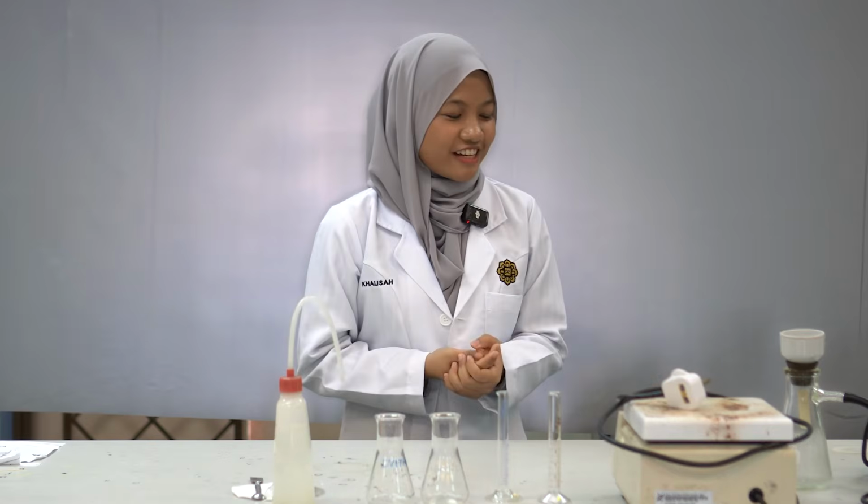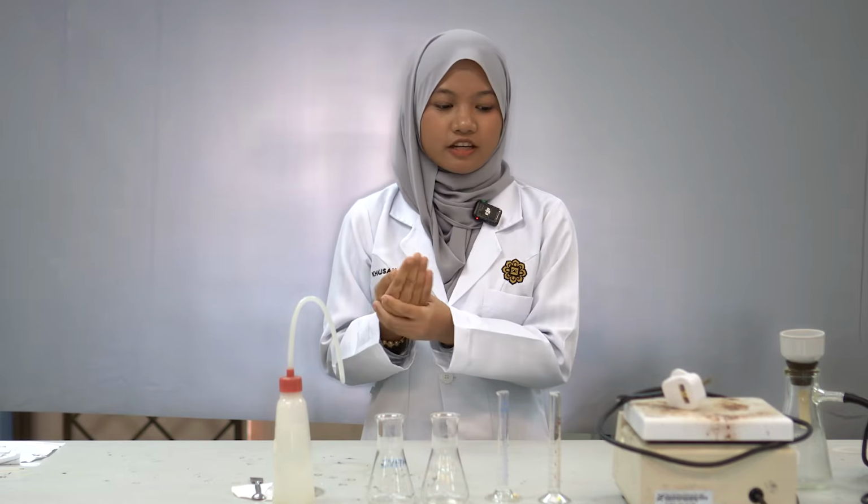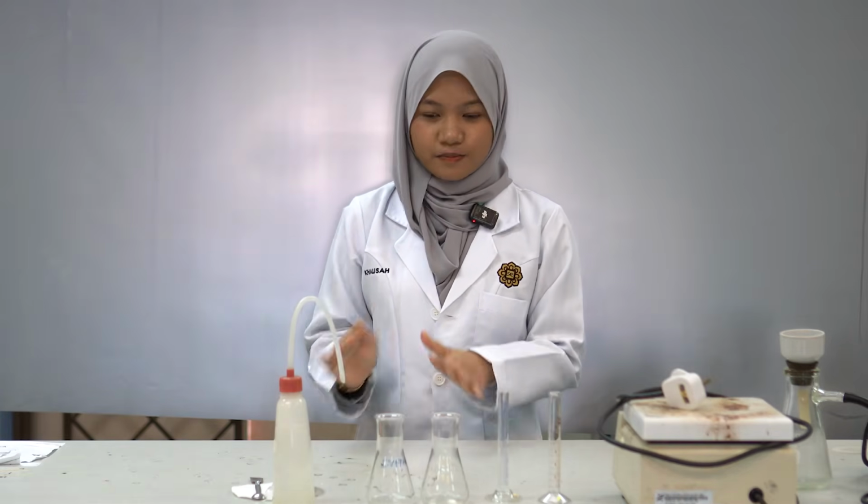Next, during the vacuum filtration, set up the apparatus properly and securely, and don't touch the crystals with bare hands, and wash your hands after handling the chemicals. And report to the lecturer or the lab assistants if there are any chemical spills.